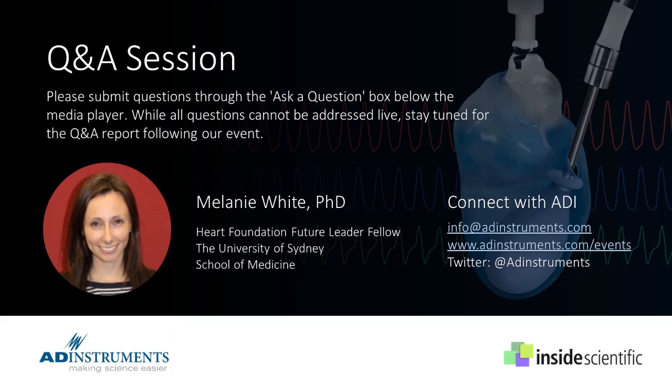But as I mentioned, not only is it important to have a minimum exclusion criteria, but also a maximum exclusion criteria. When you consider the fact that a lot of the time we're considering how the heart responds by comparison to our end baseline period, if you've got, let's say, a rate pressure product above 45,000, it's going to be incredibly hard for that heart to recover to anything close to that.